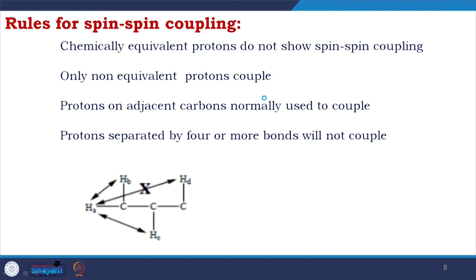Now, coming to this, HA and HB, if they are equivalent, they will not allow coupling.